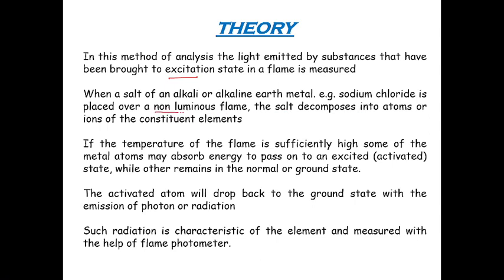So what is the meaning of non-luminous? Non-luminous means the flame which is blue in color, having a sufficient supply of oxygen. It is hotter and less light producing. So it is blue in color, more oxygen, and more heat and less light will be given by a non-luminous flame. Its opposite is the luminous flame, which is yellow in color. There is insufficient supply of oxygen, and it will give less heat and more light. That is the meaning of luminous flame. And in this we make use of non-luminous flame, where the oxygen supply is sufficient.